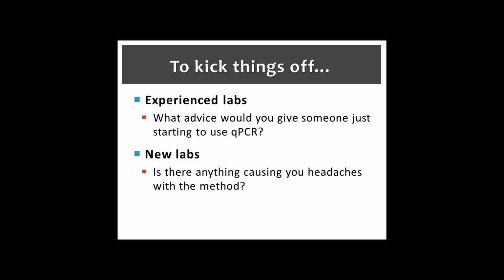And our lab is currently using an assay for bovine markers, especially in Michigan. They want to know whether the contamination is coming from a farm or from a human source. And I think in the next few months, we're going to try using pig markers and also poultry markers.